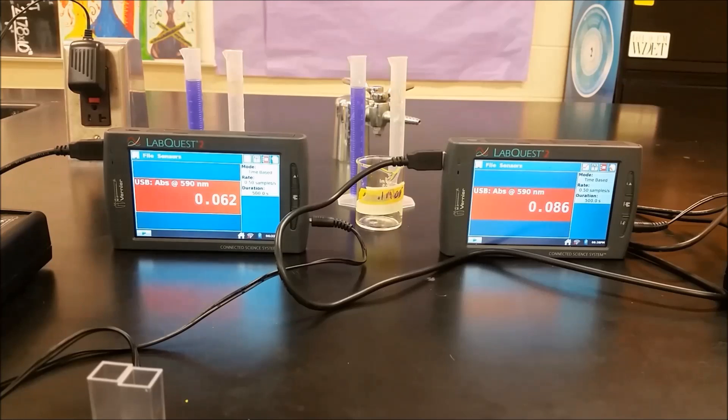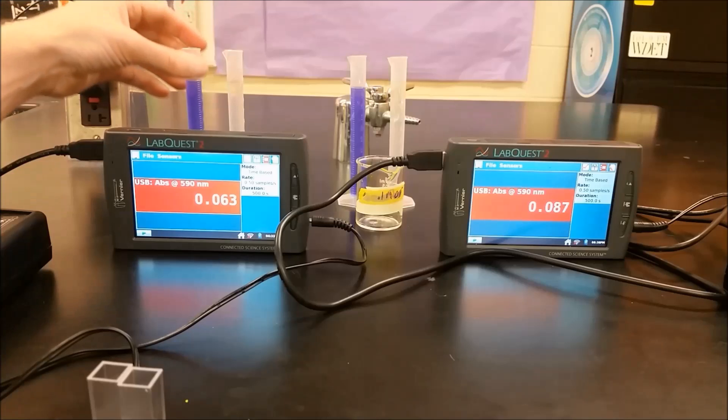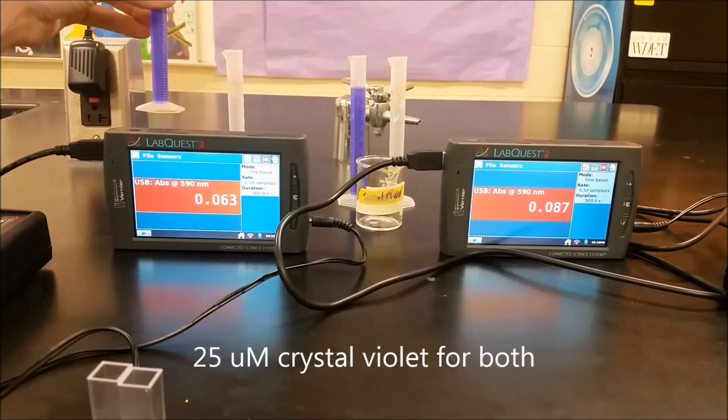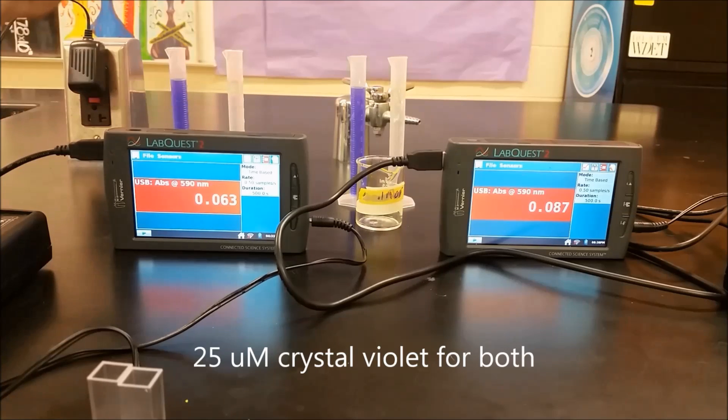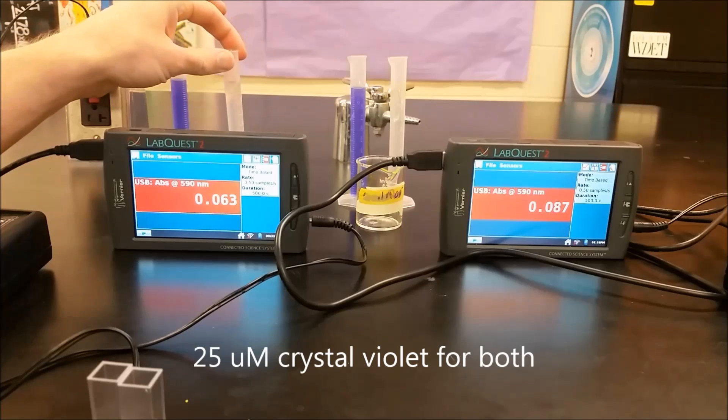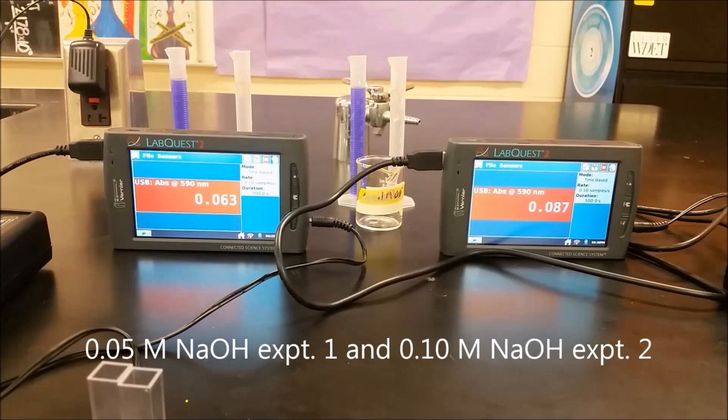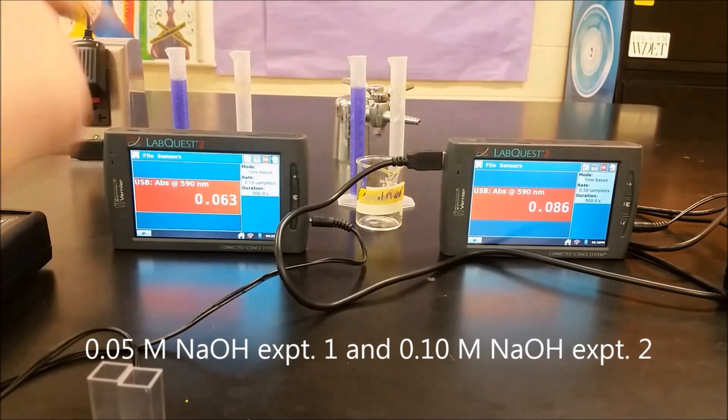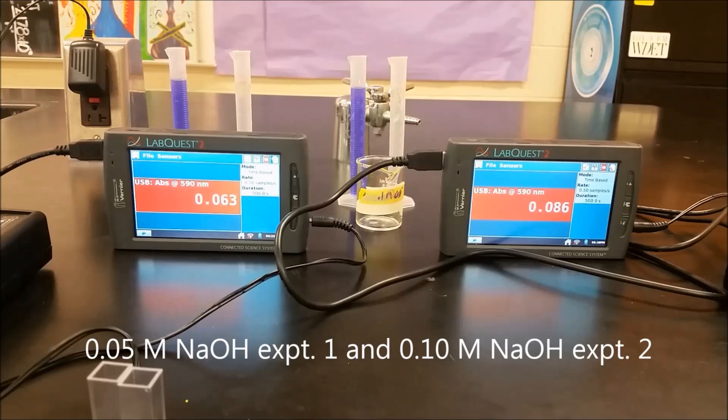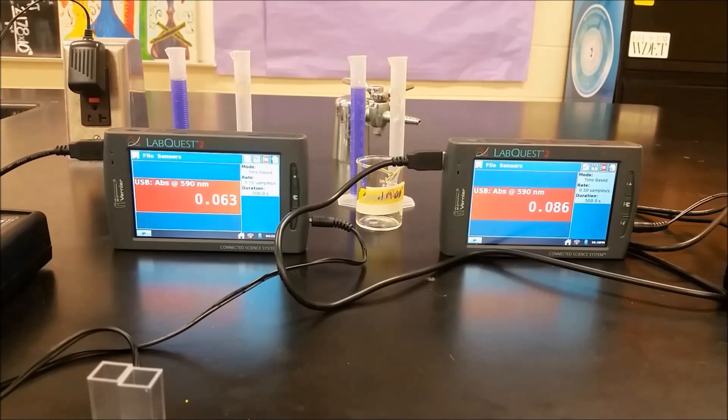So now we're ready to begin our kinetics experiment. And we've set up two situations to run side by side so you can see and compare. So we have a 25 micromolar crystal violet solution for both. And over here we have 0.05 molar hydroxide. And then over here we have 0.1 molar hydroxide. So what we're doing is we've doubled the concentration of hydroxide while keeping the volumes constant. So we're going to mix the two and we're going to run.